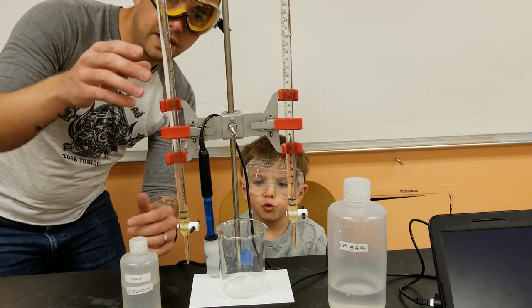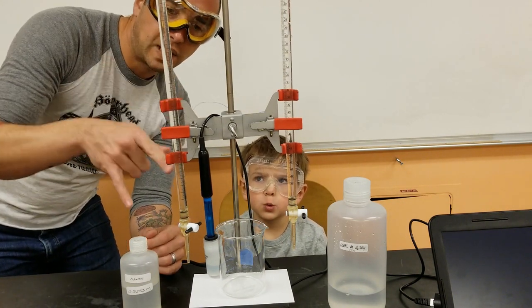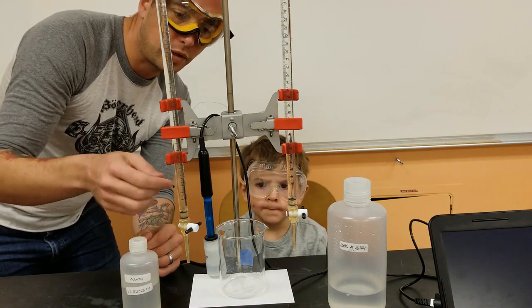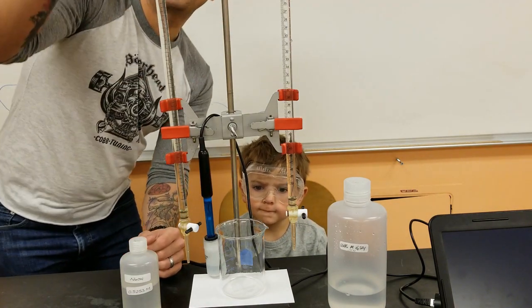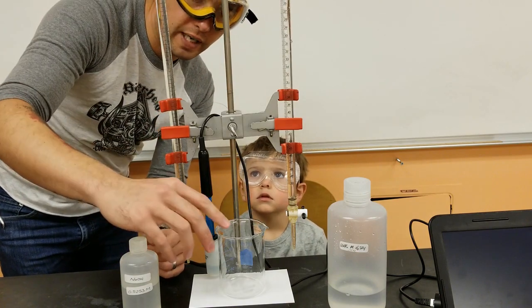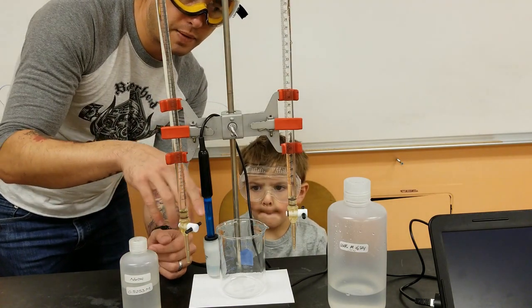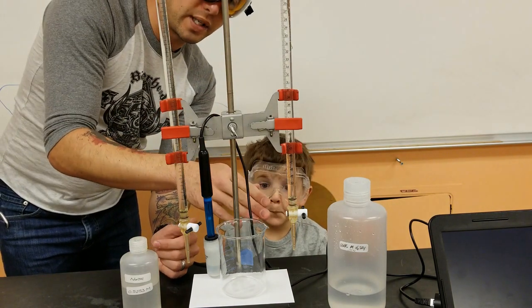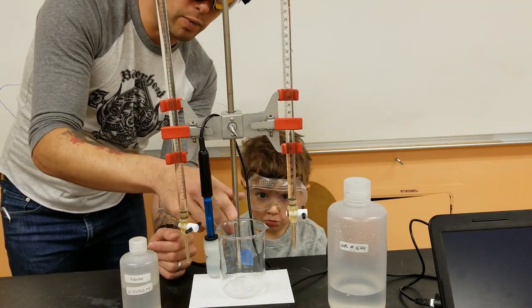So now with each of these conditioned and filled with the sodium hydroxide and the sulfuric acid, I filled them up past the 0 mark, and I'm going to very carefully drop some of these, each so that their starting level is at the 0 mark, into a waste beaker.